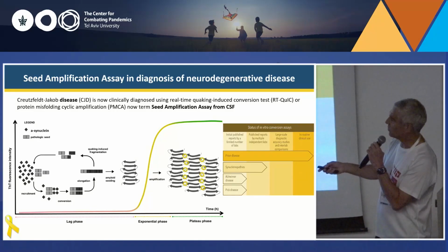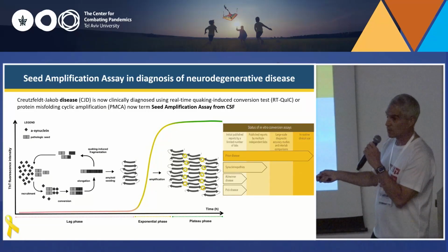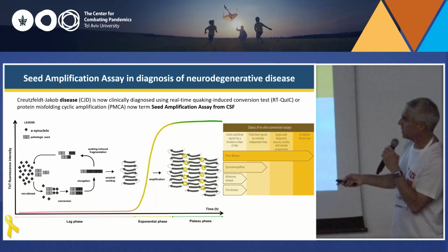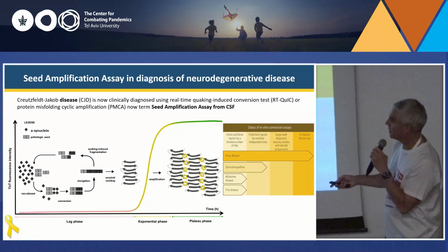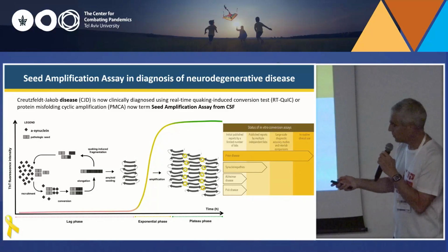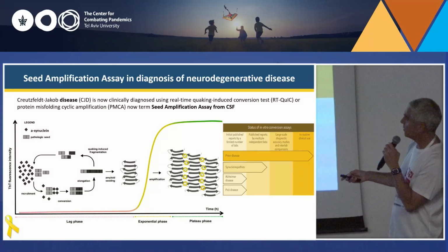When they create fibrils, you break them, you fragment them, and you run this several times. It's like a PCR for seeds. And if you add a fluorescent tag, thioflavin, which you probably might know, it will bind in between the beta sheets, and the fluorescence will increase.